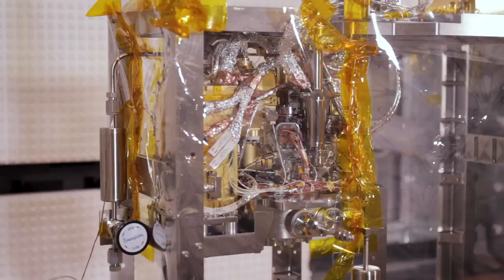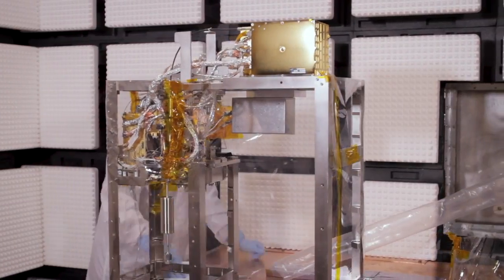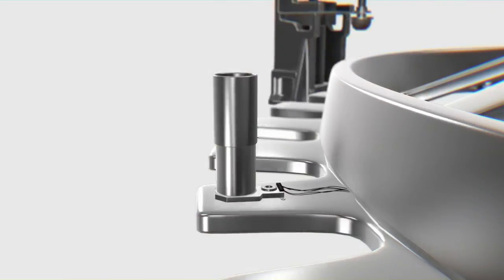MOMA is designed with a mix of proven hardware and innovative new technologies. Here's how it works.